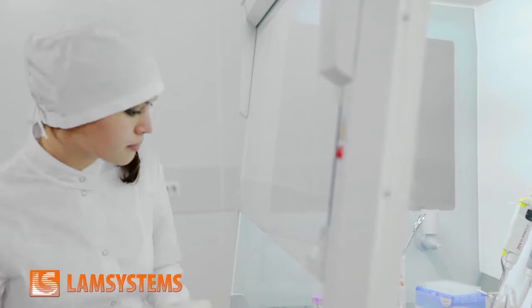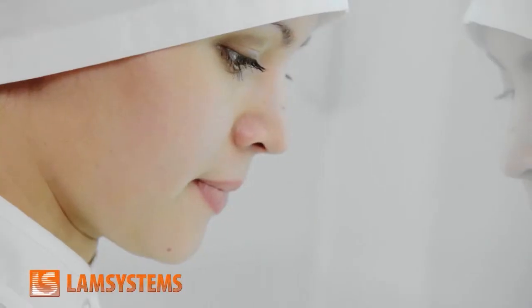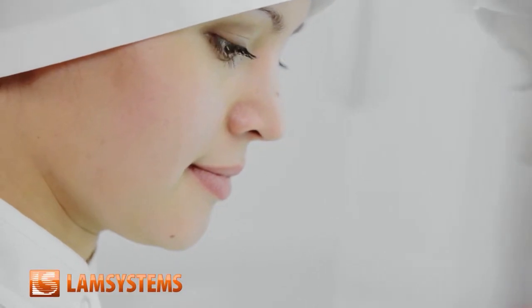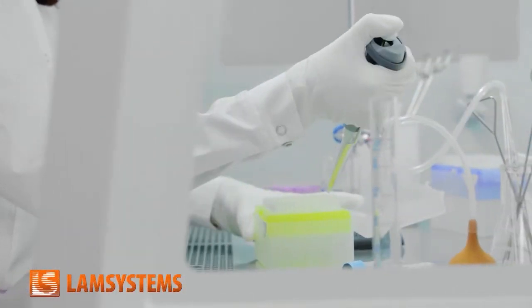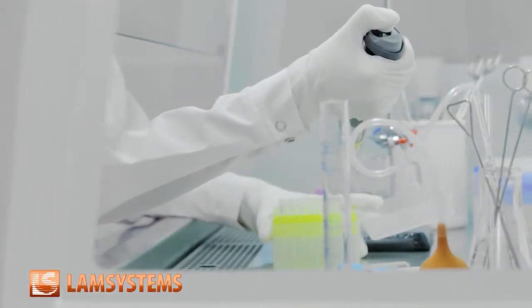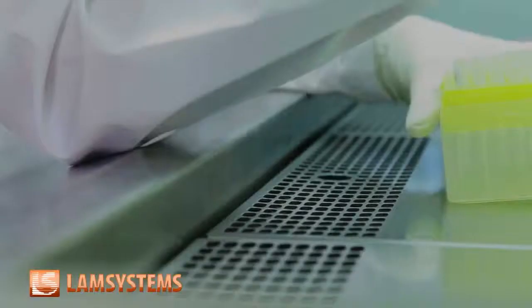We have already mentioned the air curtain in the front working opening, which ensures the personnel protection under the specified air velocity and integrity. The cabinet safety regulations appeal to the personnel to keep their arms raised while working, so as not to block the front air grill and not to break the air curtain integrity.